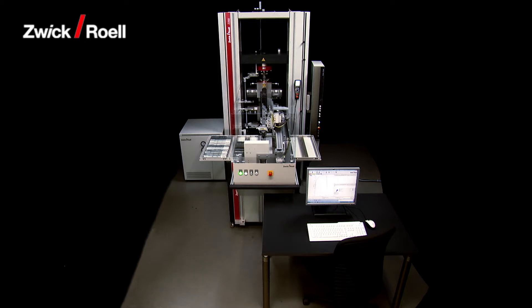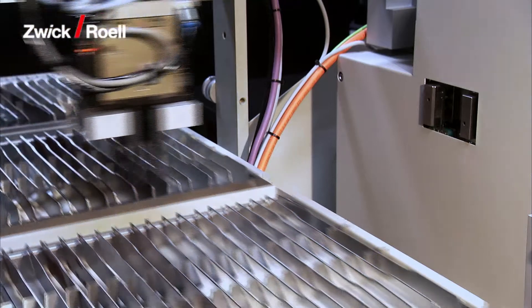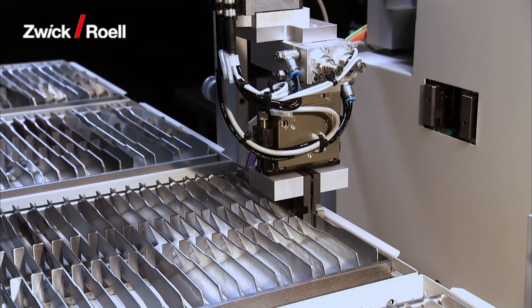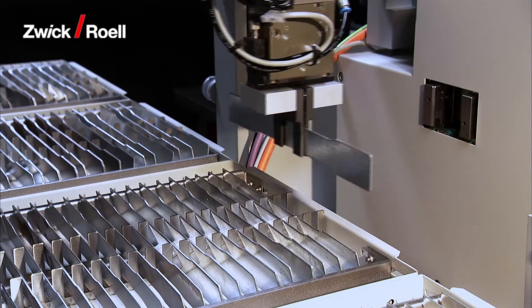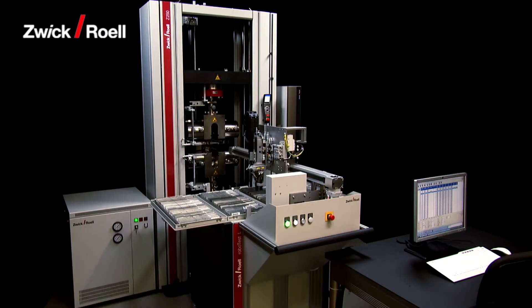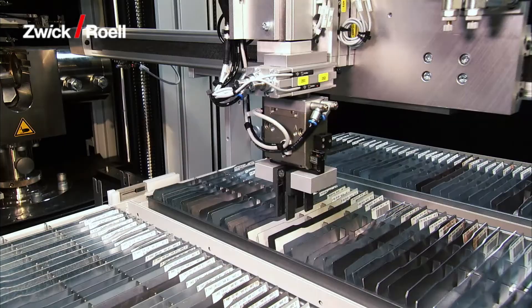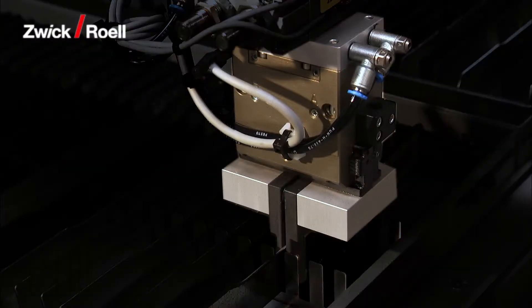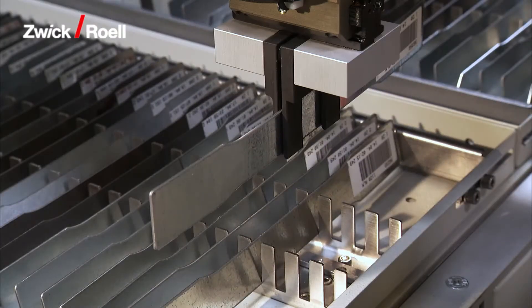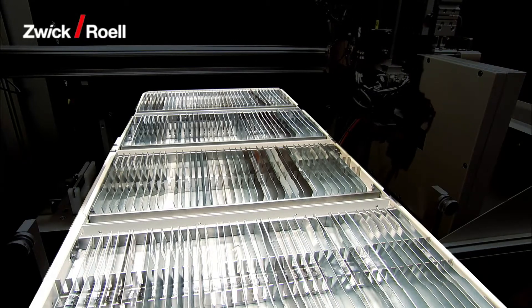The RoboTest-L testing system is designed for traceable automatic testing of plastics and metals and other dimensionally stable specimens with a specimen weight up to 1 kg. It consists of the following functional units: the RoboTest-L robotic feeding system itself, the specimen gripper for transporting specimens to the machine and removing specimens after testing, and the magazine for up to 160 individual specimens.